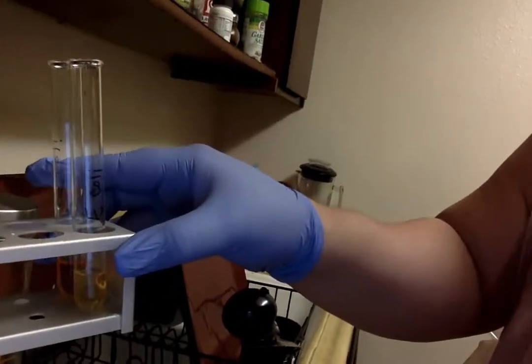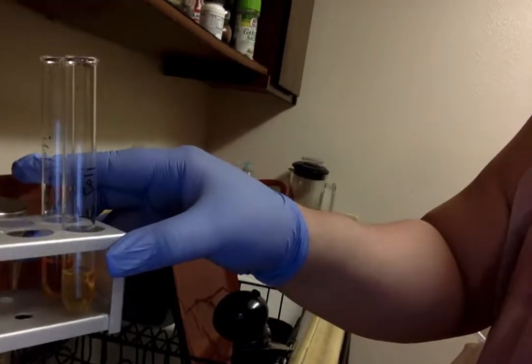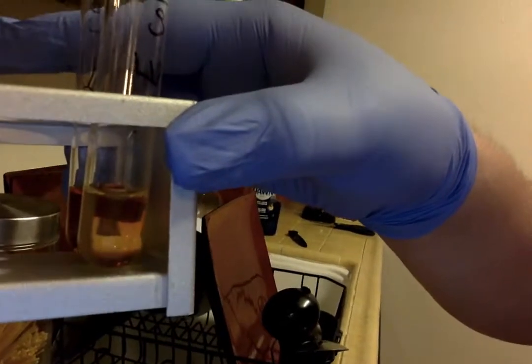You can see it here. More of a little red for the epidermidis on top. And then the E. coli. Okay, so that's yellow. So that was a negative.